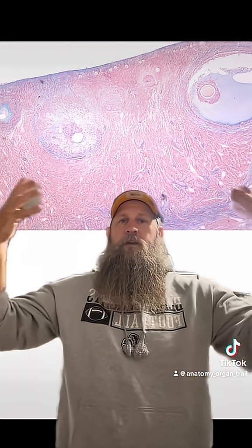Other things that we can see are the connective tissue known as the stroma surrounding it. And then you can see this epithelium up here known as the germinal epithelium. It's called the germinal epithelium because it was once thought that these cells produce the primary follicles or the germ cells, the eggs. But we now know that that's not actually the case, and that the eggs or the primary follicles are all developed during fetal development. So this epithelium doesn't participate in producing the germ cells like it does in the male testis. That's what your ovary looks like.